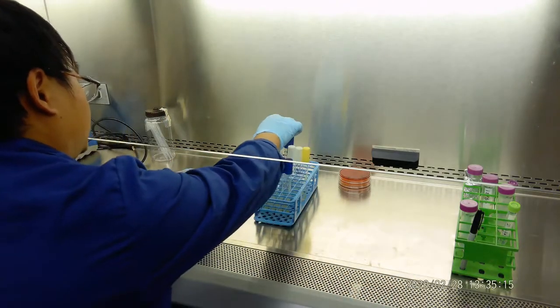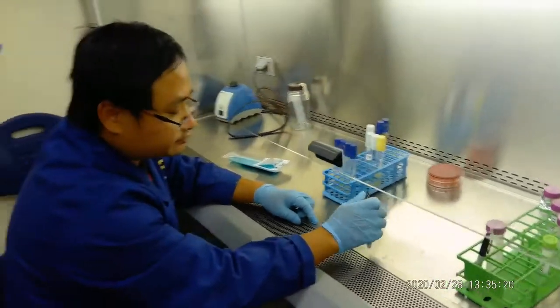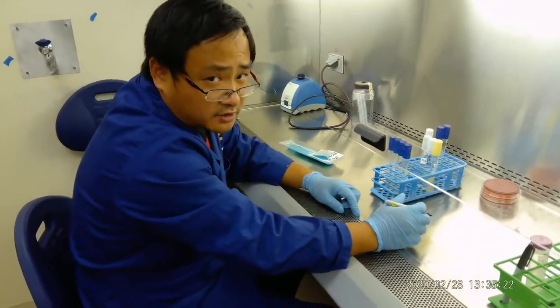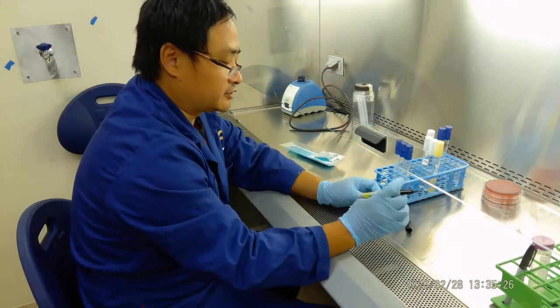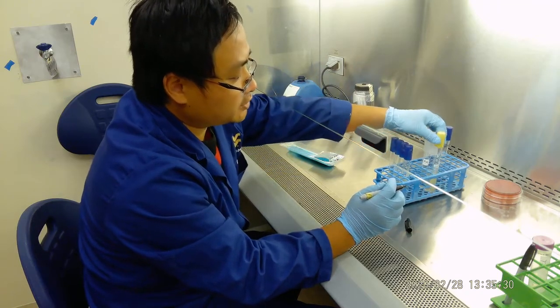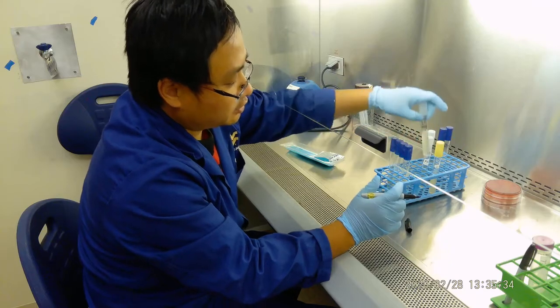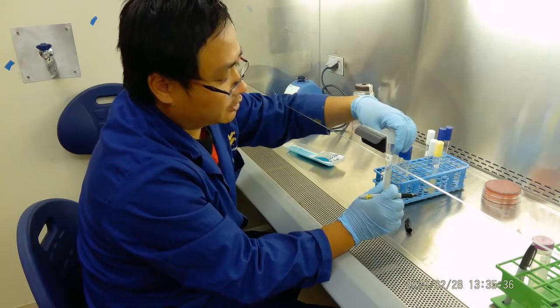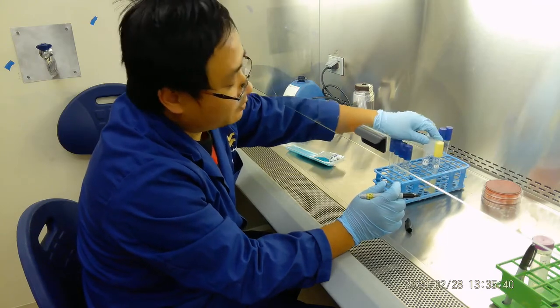Okay. So this is the first job. Now the second job is that we want to see the impact of the temperature on bacterial growth. You know the psychrophiles, mesophiles, thermophiles. So we want to label these at different temperatures. Now you will be assigned a culture. Each of you will do either Staphylococcus aureus, E. coli, or Pseudomonas aeruginosa, or Bacillus subtilis, or Bacillus cereus.